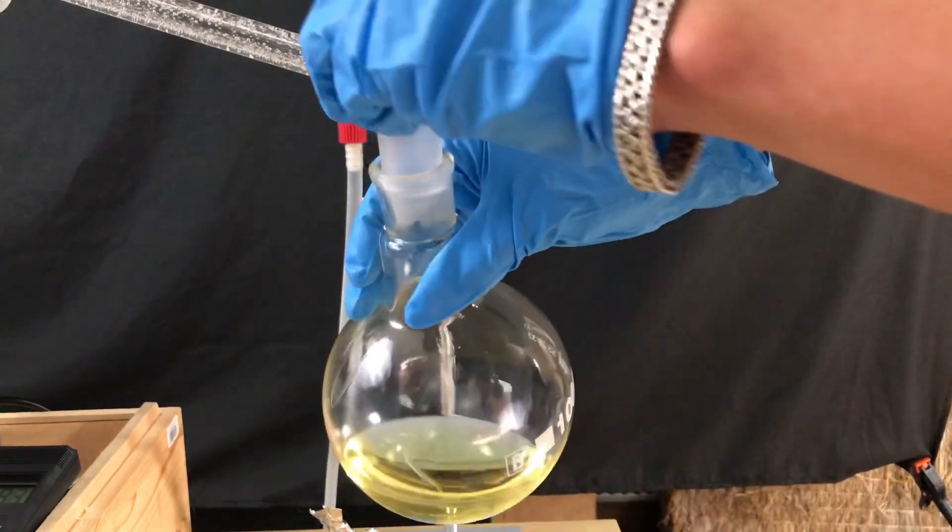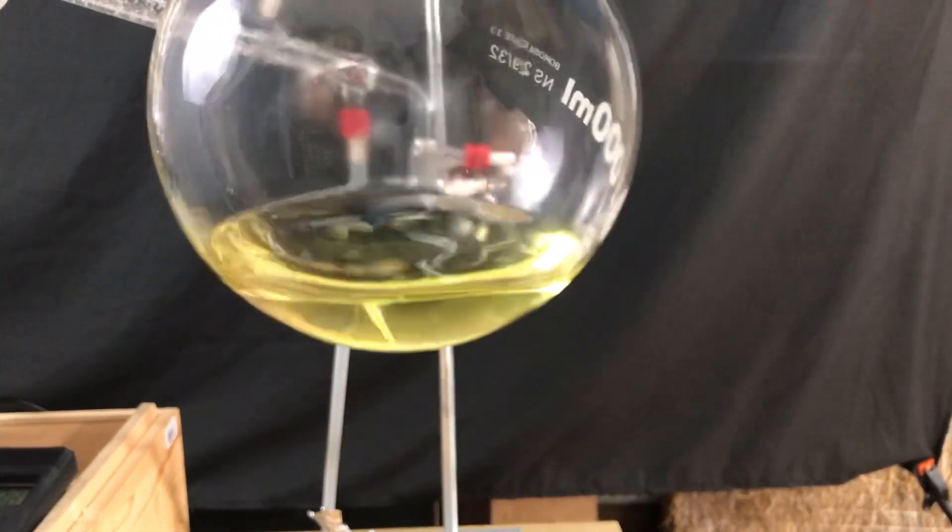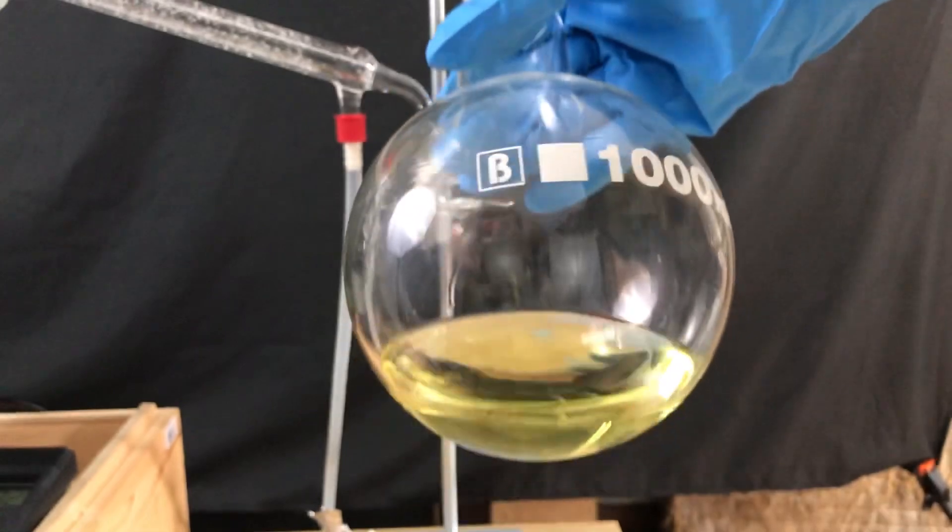Flask was removed and stoppered. You can see that this 1,4-dioxane is yellow and this is due to some contaminants.